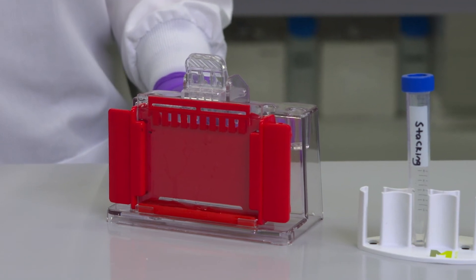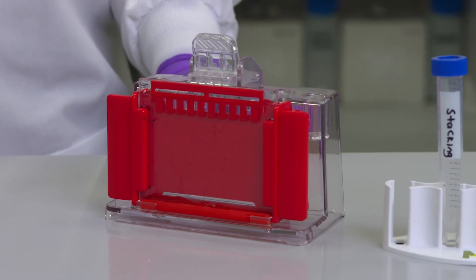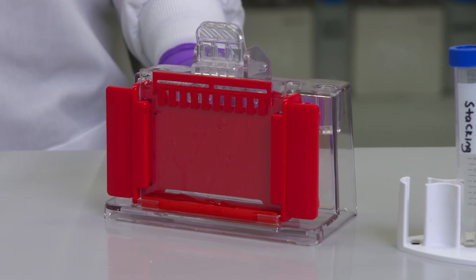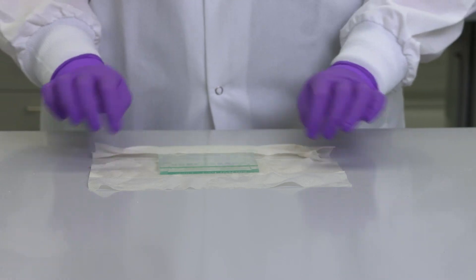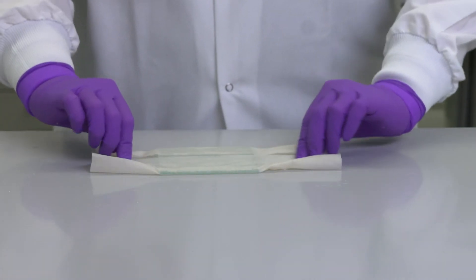Let the gel polymerize in the casting stand for one hour before using it or storing it for later use. Gels can be wrapped in wet paper towels and stored in a Ziploc bag at 4 degrees Celsius for up to 4 weeks.